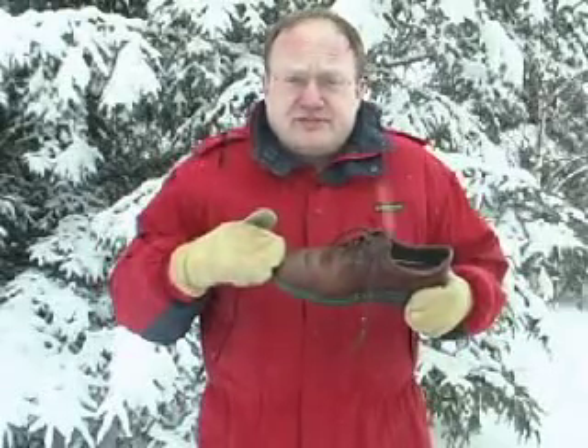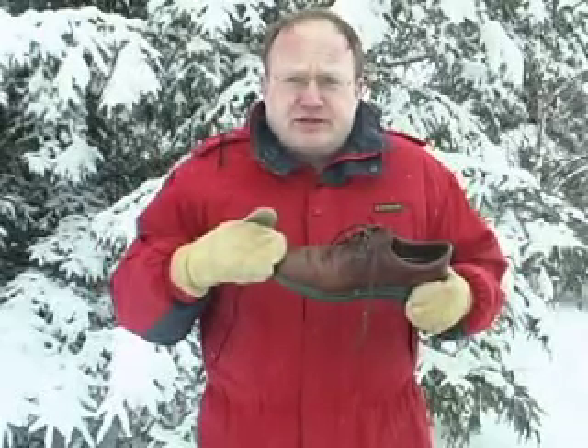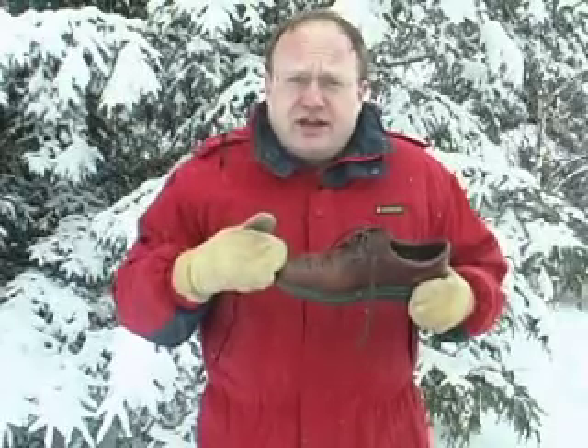While performing your experiments make sure you wear closed-toed shoes in case there are any spills, and a lab coat to protect your clothes. Also, if you have long hair tie it back so it does not interfere with your experiment.